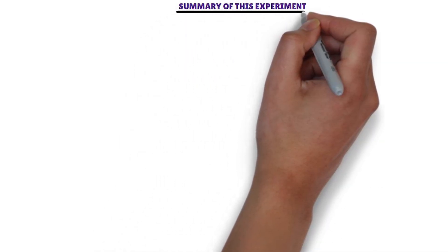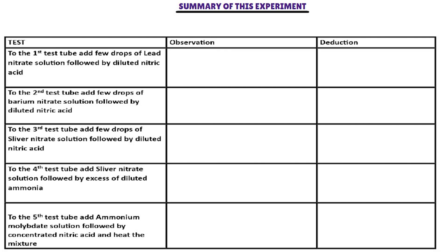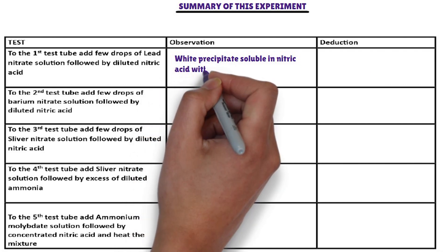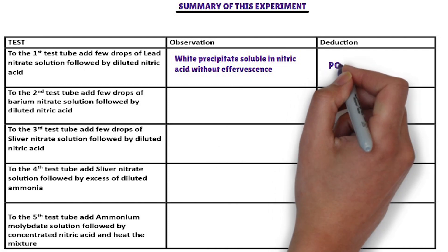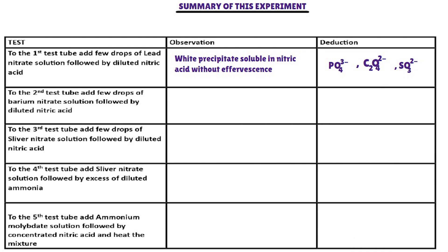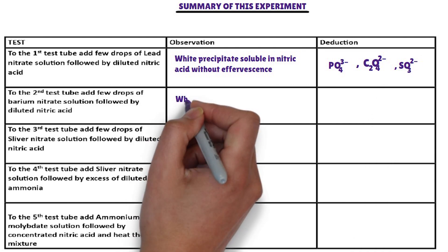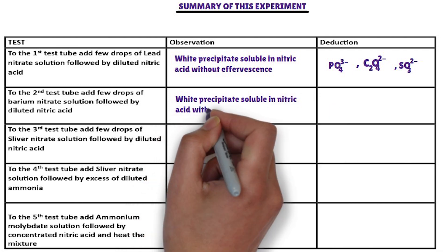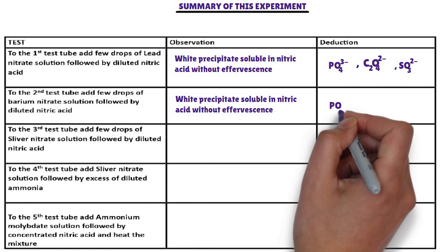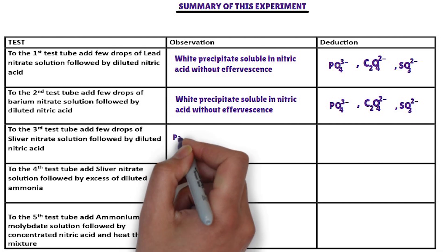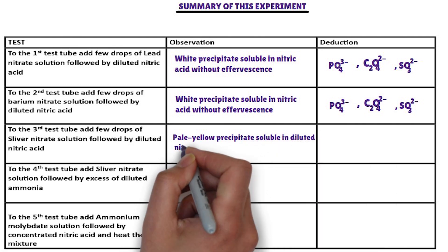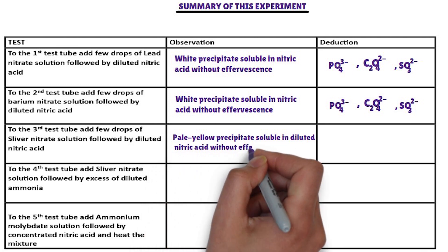Summary of this experiment. To the first test tube, lead nitrate solution is added followed by diluted nitric acid. The anions that form a white precipitate with lead nitrate, soluble in nitric acid without effervescence, are: phosphate ion, oxalate ion, and sulfite ion. To the second test tube, barium nitrate solution is added followed by nitric acid. The anions that react with barium nitrate to form a white precipitate soluble in nitric acid are: phosphate ion, oxalate ion, and sulfite ion. To the third test tube, silver nitrate solution is added followed by diluted nitric acid. The anion from the above list whose precipitate is soluble in nitric acid without effervescence is phosphate ion.